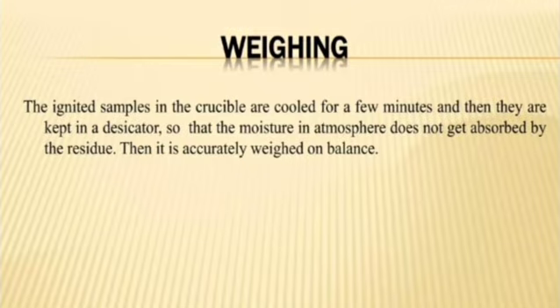Weighing. Ignited samples in the crucible are cooled for a few minutes and they are kept in the desiccator, so the moisture in the atmosphere does not get absorbed by the residue. They are accurately weighed on the weighing balance.